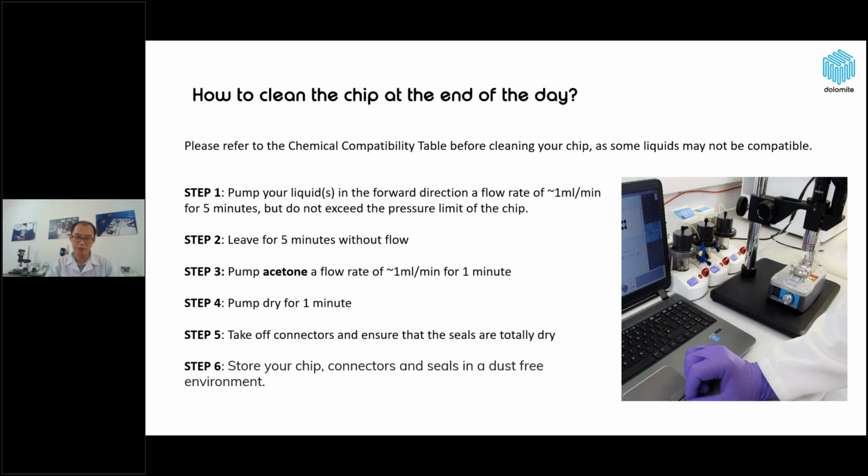That will be fine. And before doing the cleaning procedures as following in the slide, please refer to the chemical compatibility table before cleaning your chips, as some liquids may not be compatible with your chip.